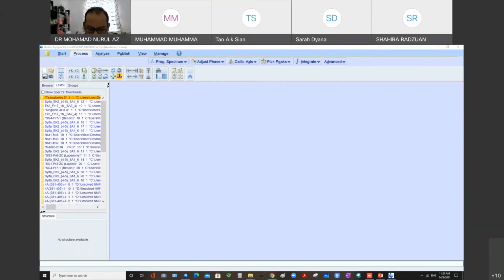Okay, let's go to the carbon first. It's 11:21. Okay, I'm using the data that is here.